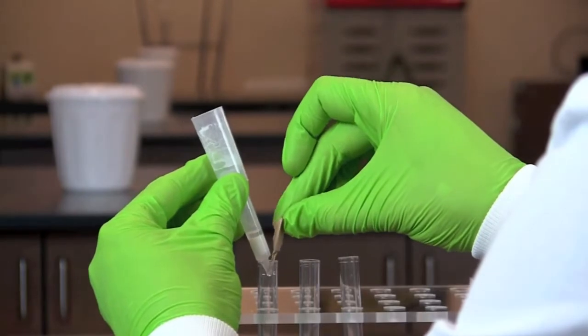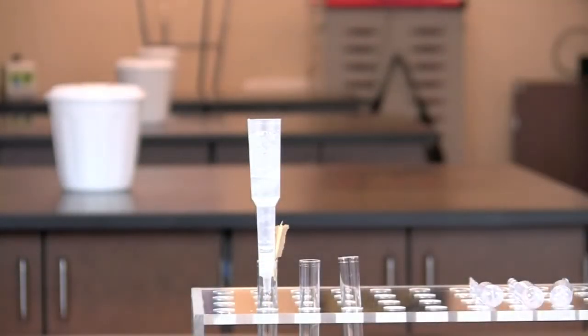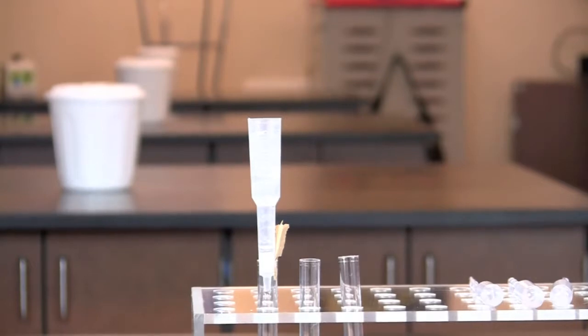Insert a small wedge of paper between the column and the collection tube to prevent the formation of an airtight seal, which would slow the flow of the sample through the column.